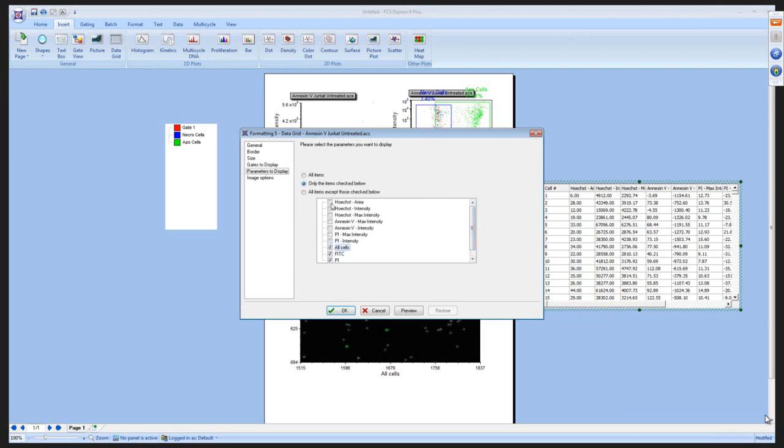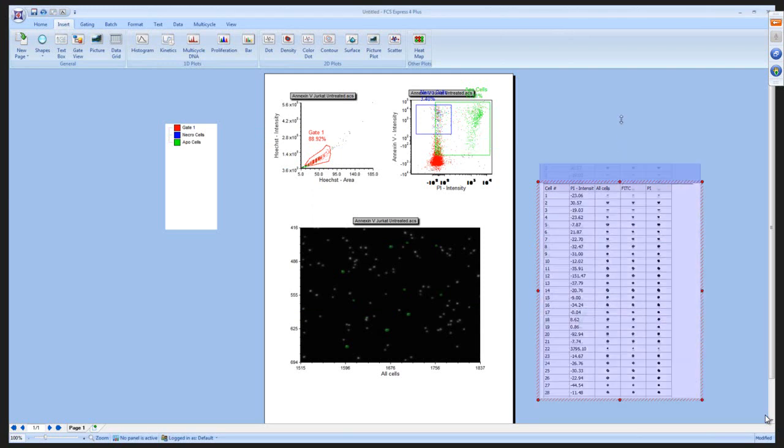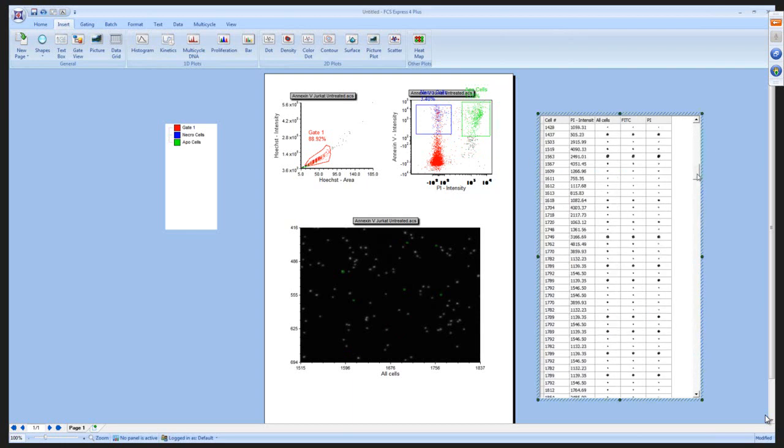And what you'll notice is that we actually have little cutouts of all of the cells that appear in this assay. And we can scroll down this, and you'll notice that there's many, many, many thousands of cells here. And the nice thing is that we can actually apply gates directly to this. So if we only want to look at the cells that fall within this population, we can do that. We can get an idea of what those cells look like, and all of these things are going to be updating in real time for us.